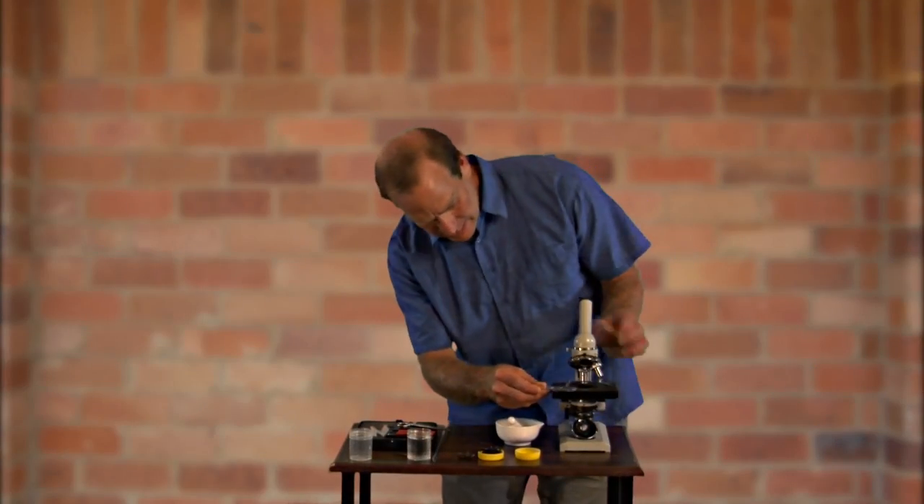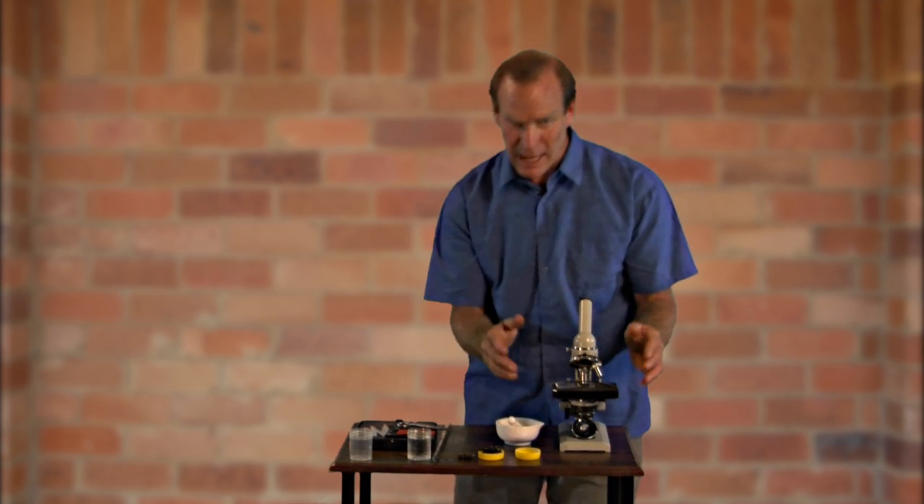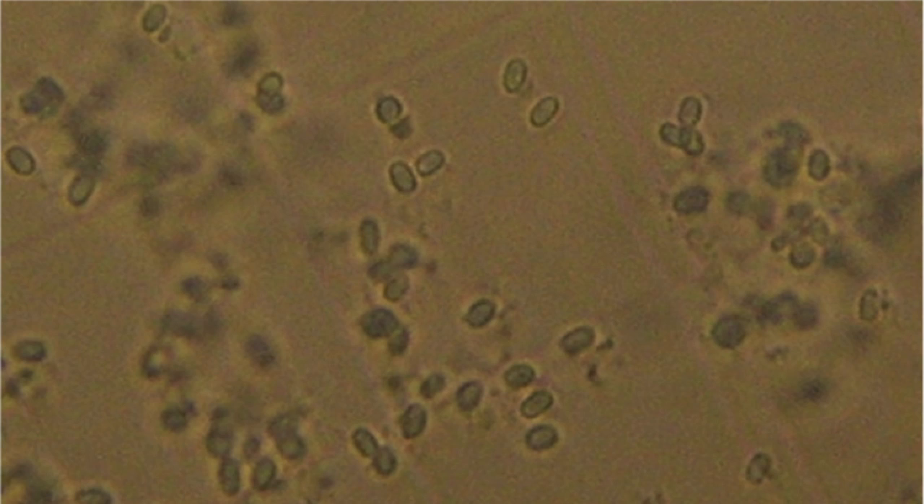So then it's a matter of just looking at it under the microscope, finding the focal point, and then counting the number of spores within a set area.